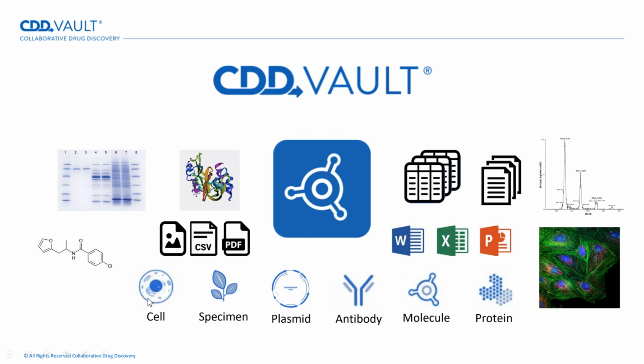But you can also register biological specimens that are not small molecule compounds and track data associated with those entities that you're registering. Some examples: maybe you have cell lines that you want to keep track of, or plant specimens, plasmids that you're constructing, antibodies, and so on. And then all of the data associated with those registered entities can also be stored within the vault.